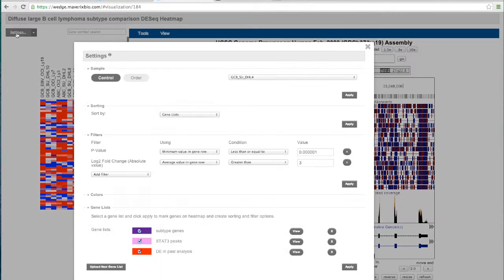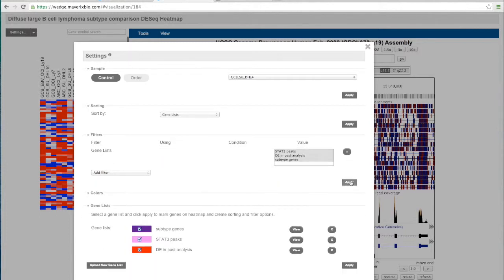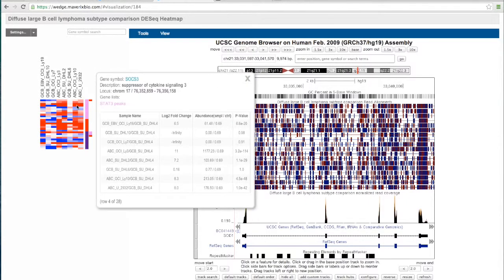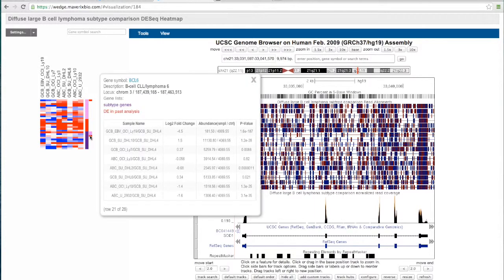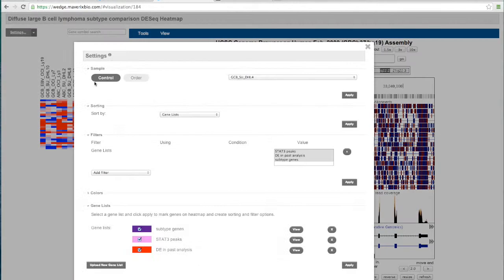And if you had a really large data set, maybe you had a huge number of genes in these gene lists that you wanted to review, maybe you had a microarray analysis you've done previously and you had a giant set of genes in a list that you wanted to use, you could actually filter the entire data set by just those sets of genes. And maybe we even want to remove these and just see all of those genes. And now once I've filtered, that's the limit of what I'm looking at now in my heat map, is just that set of genes. And so this is a nice feature to be able to customize that heat map view to see exactly what I want to see and avoid being overwhelmed by all of the noisy data that might be there.